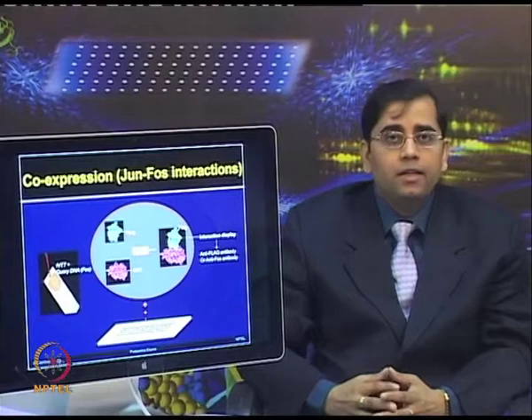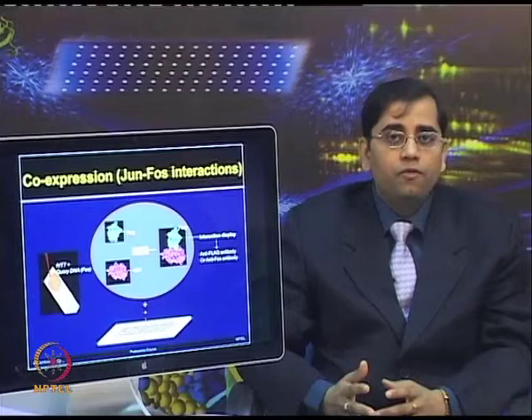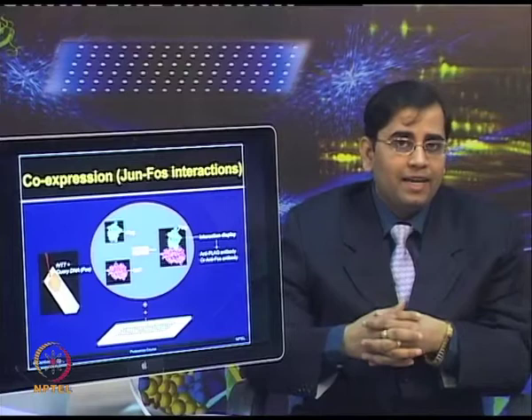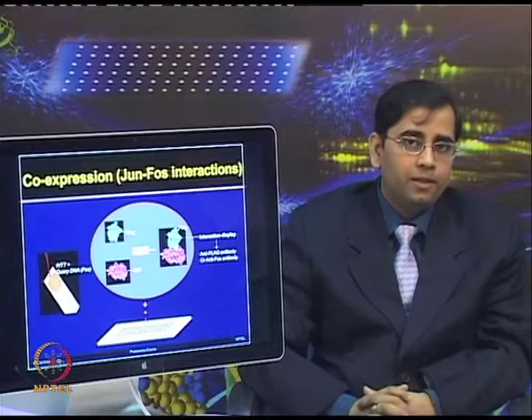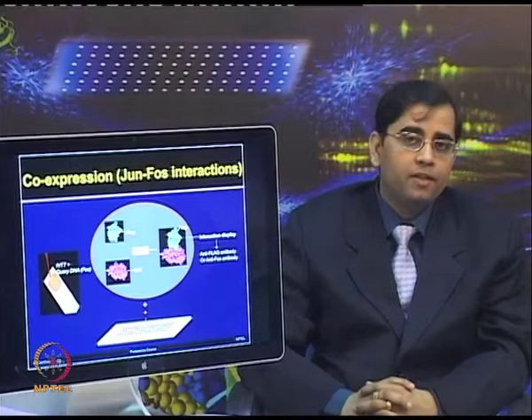It means the query proteins along with the arrayed proteins were expressed by using the cell-free expression system. So, there was no need to in fact purify the query protein as well. When the protein interaction study has to be performed, you take the cDNA of Fos, for example, and mix it in the rabbit reticulocyte lysate along with the other in vitro transcription translation machinery. You mix the whole cell lysate on the chip surface, and after incubation, when proteins are expressed, the query cDNA will also express the protein, and if it finds its binding partner, it is going to bind to those features, which can be detected by using protein specific or tag specific antibodies.